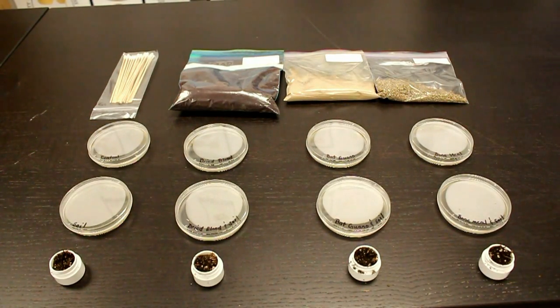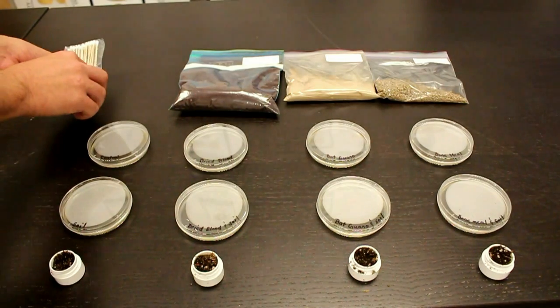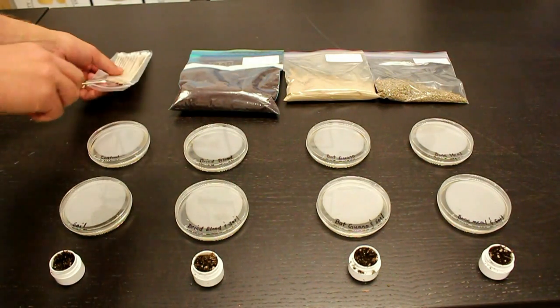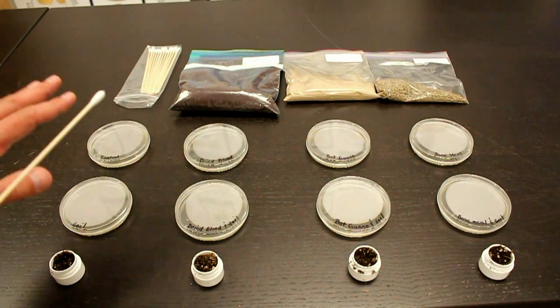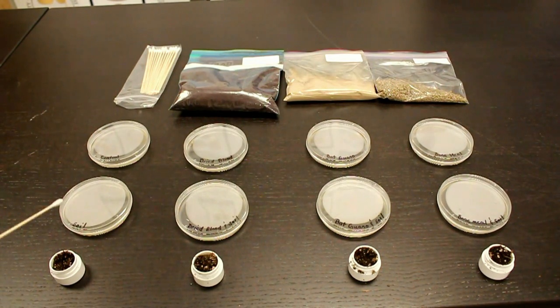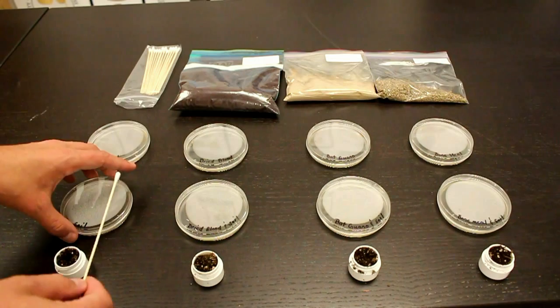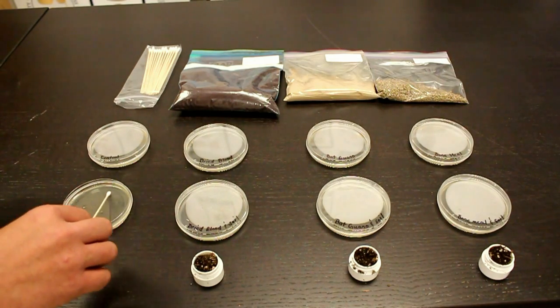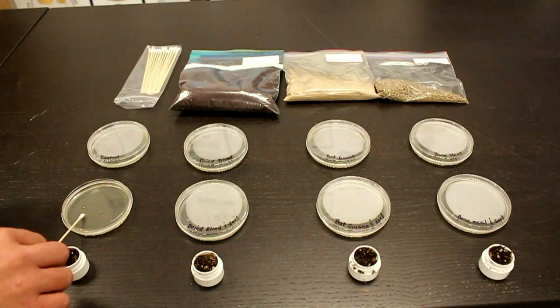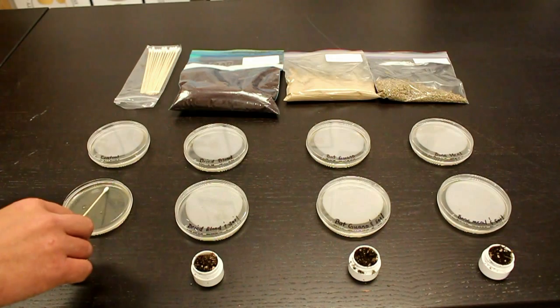Okay, all of the agar has settled and we're going to start with our swipe test. We'll take the swab directly out of the bag and get started. The control we're going to leave as is — I don't want to touch that. I just want to make sure that stays as is after we added the agar, and my first swipe will be done with the soil sample.